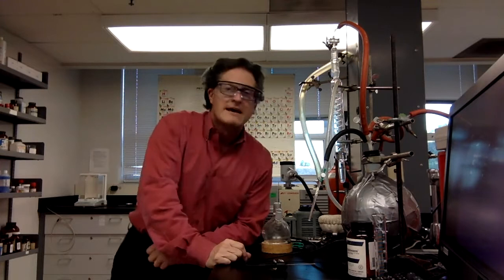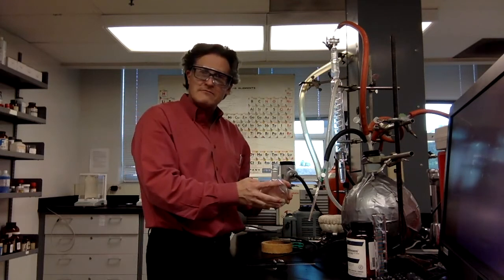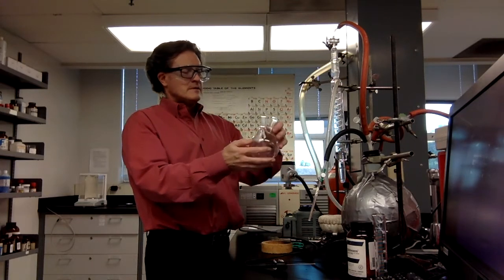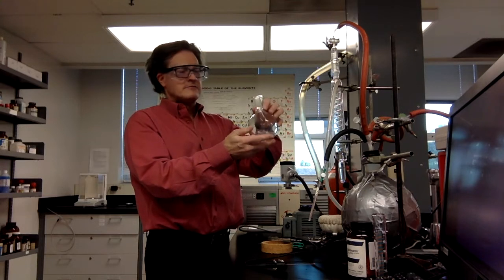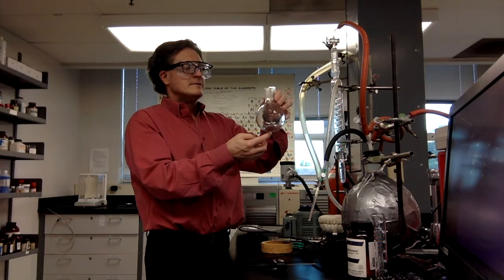But the last thing that we want to do is, vacuum systems like to be under vacuum. So after we dispose of the ethanol appropriately and have this cleaned out, don't leave the boiling chips in there.